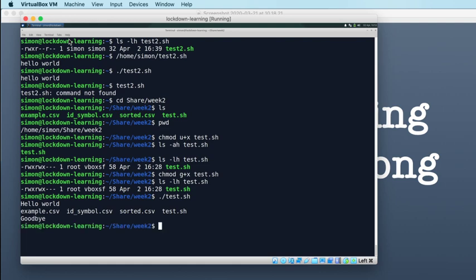You'll notice that this worked exactly as it would have worked at the command line, except our colours have gone in the results of ls. And that's because we're running it from within the environment of a script, and it's not able to add those colours to the output in a straightforward way. So we don't get the colours, we just get white. For most purposes, that's fine. And actually, ls is not something you will commonly do within a script, at least not just to print those results to the screen anyway. So it isn't the end of the world that you lose that pretty colouring.